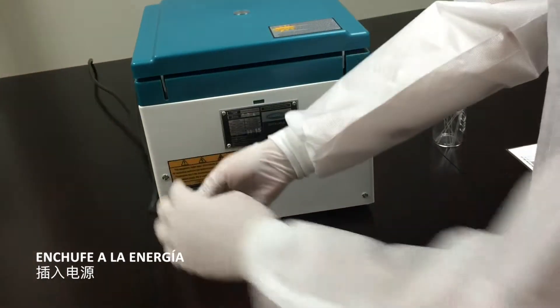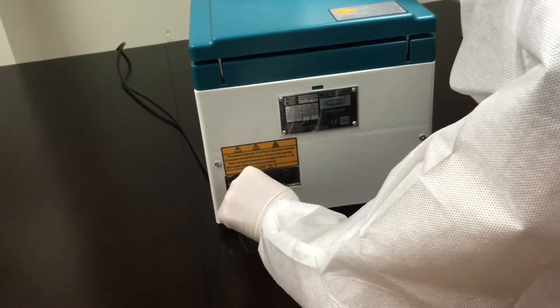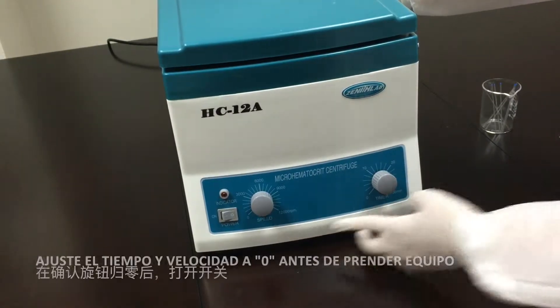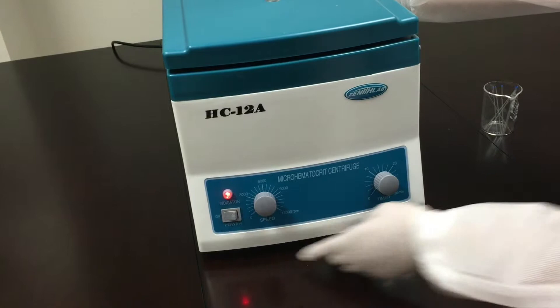Plug into power. Adjust the timer and speed to zero before turning on the device, then turn the switch on.